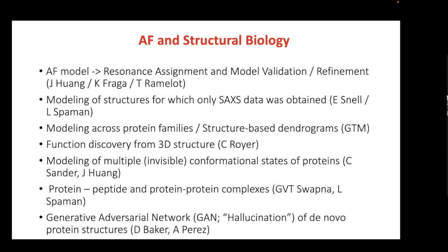And AlphaFold, of course, is not only relevant for NMR, but broadly for structural biology. The AlphaFold models can be used for guiding resonance assignments and model validation, some work we're doing. We're taking SAXS data where we couldn't get experimental structures any other way and seeing if we could use the models and fit them into the SAXS data.